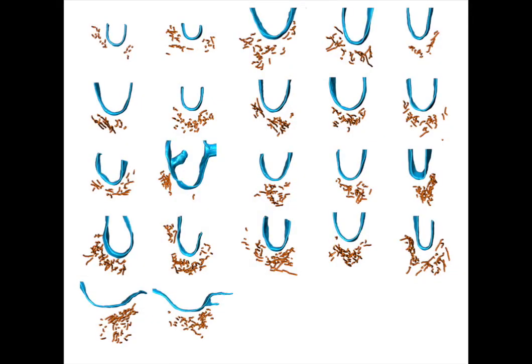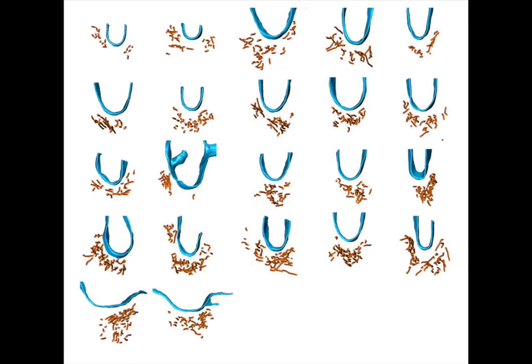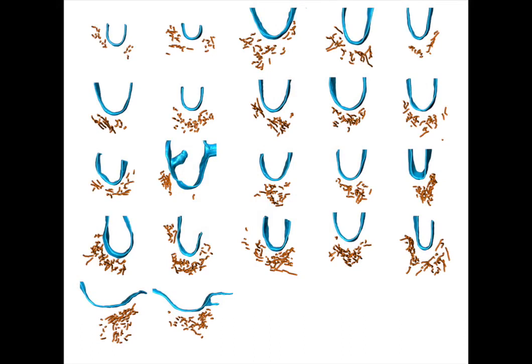Viewing all segmentations at the same time quickly illustrates the variability seen in the cross-sectional shape of the actin bundle. In cross-section, the actin bundles contained 35 filaments on average, and this number ranged between 13 and 60 filaments.